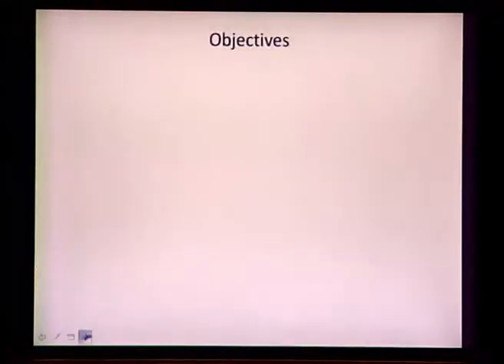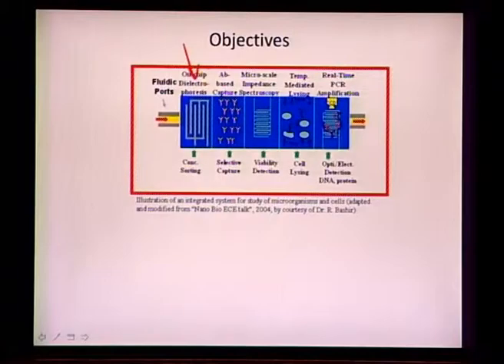Essentially, if we look at the first biochip in question, it is something which we have done before for investigating food and waterborne pathogens. The biochip has a combination of several process steps as illustrated here. There are several different analysis mechanisms combined on such a chip, and one of the reasons is that the tests in a molecular biology laboratory do not each provide every piece of information.